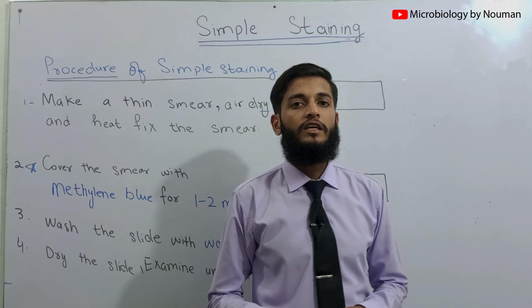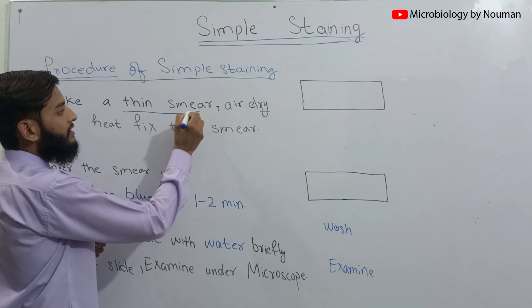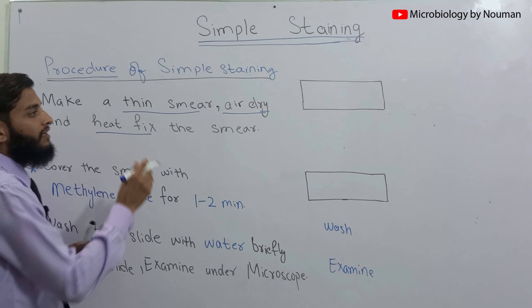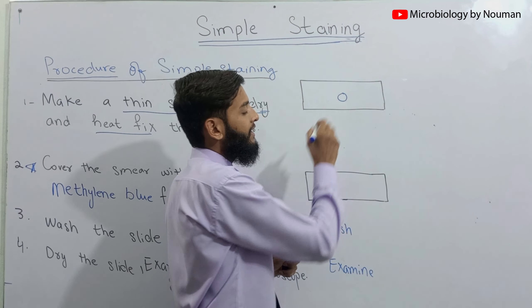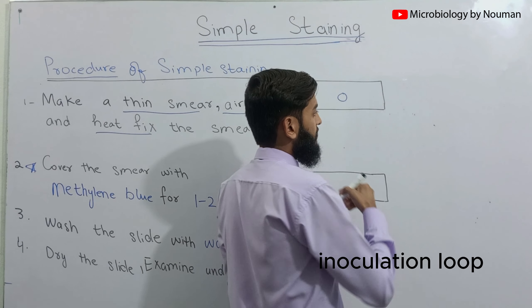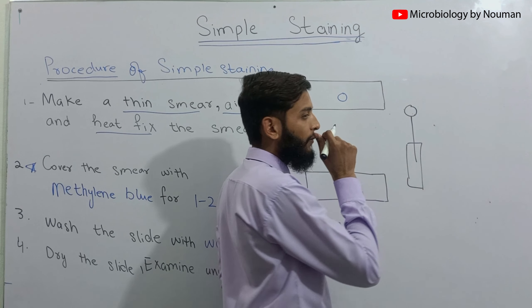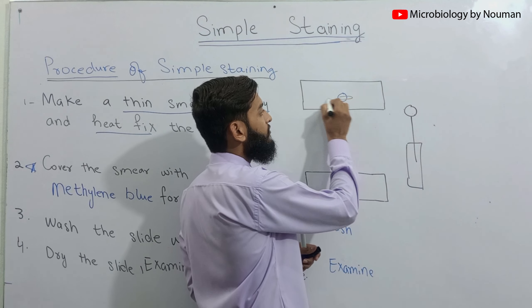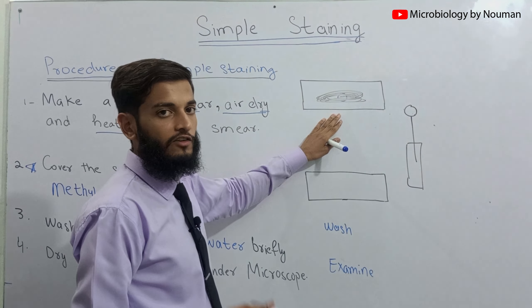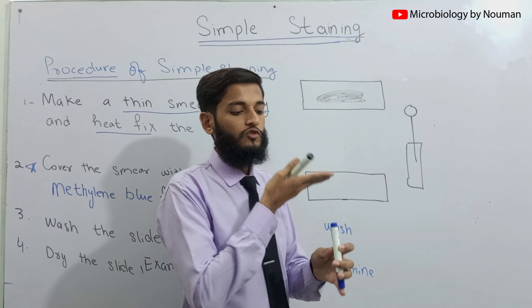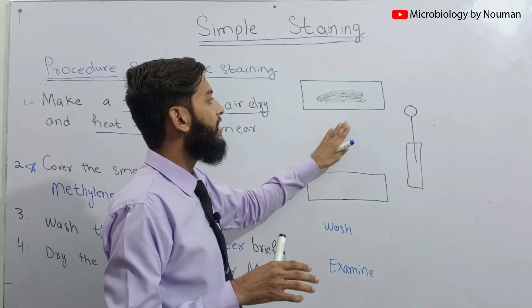The procedure for simple staining is very easy. First, we make a thin smear — we take a clean glass slide and place a drop of water in the center. Then with the help of an inoculating loop, also known as a wire loop, we pick up a bacterial colony and mix it with the water on the slide. After mixing, we wait until all the water evaporates, then pass the slide two to three times over a flame to heat-fix the bacteria onto the surface of the slide. This heat fixation process also kills the bacteria.